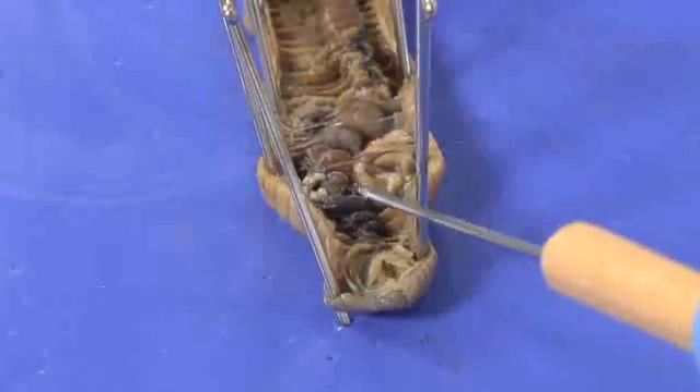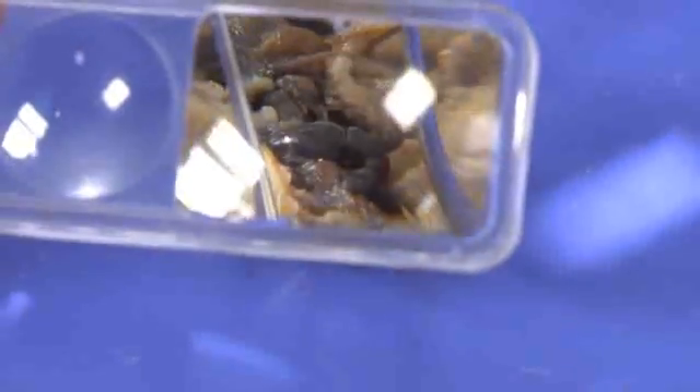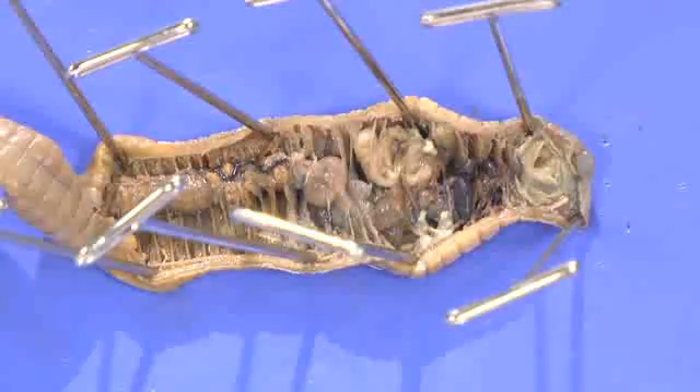Now I'm able to see the aortic arches. These act as the earthworm's hearts. I'm going to check the other organs that make up the circulatory, digestive, excretory, and reproductive systems of the worm, and make drawings and notes in my science journal.